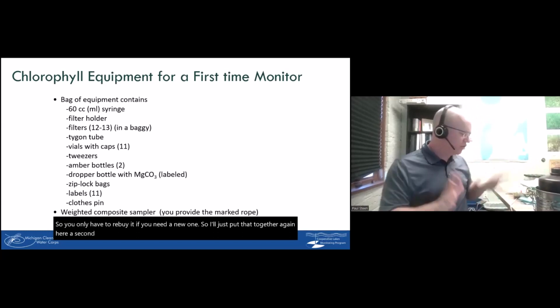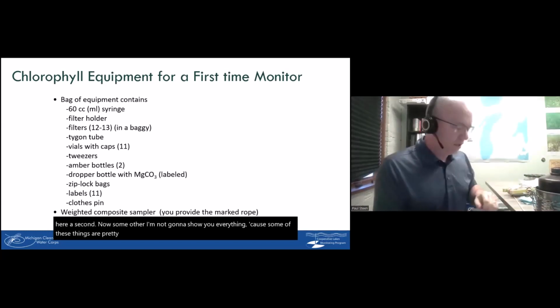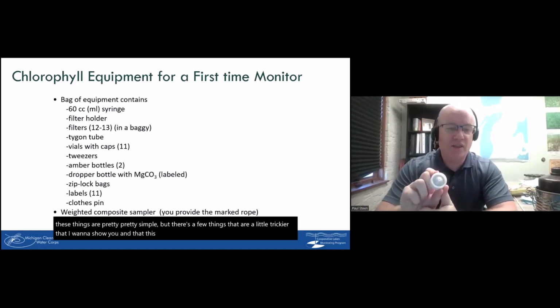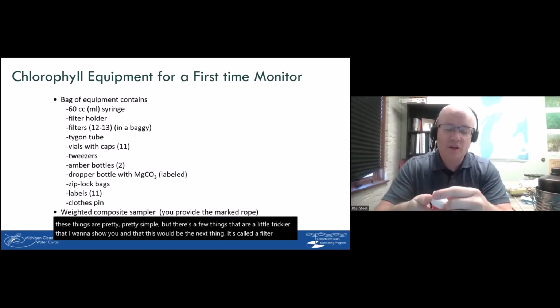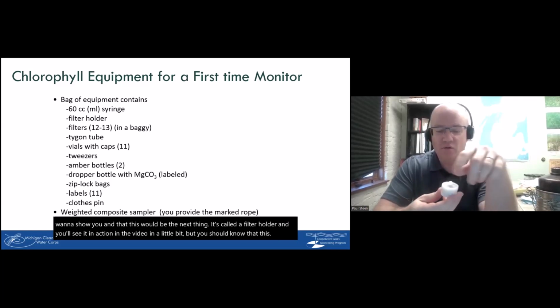Now I'm not going to show you everything because some of these things are pretty simple, but there's a few things that are a little trickier that I want to show you. And this would be the next thing. It's called a filter holder. And you'll see it in action in the video in a little bit, but you should know that this screws apart.